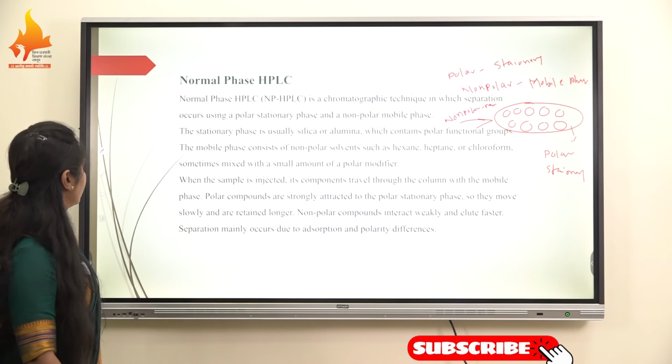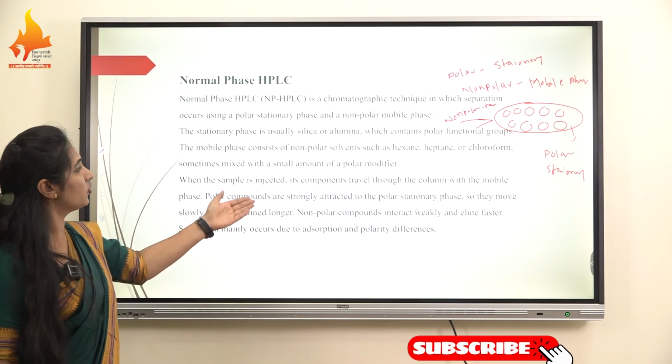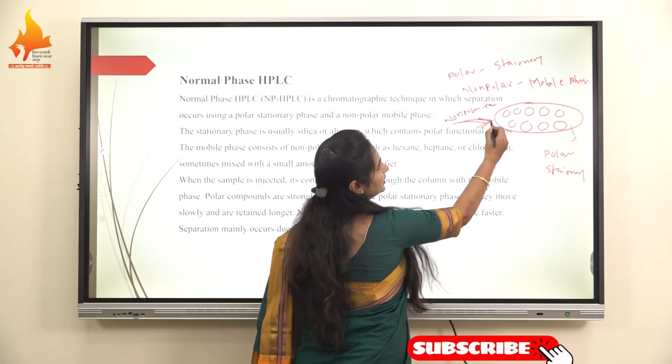When the sample is injected, its components travel through the column with the mobile phase.